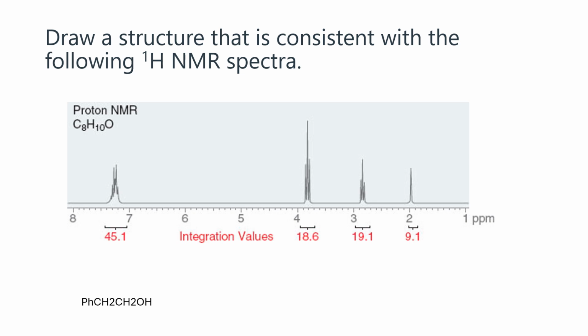Okay, now moving on, let's do these spectra. So C8H10O, so let's do the HDI. It is 1/2, and this is 16, right? Plus 2 minus 10. O doesn't count, so 18 minus 10 is 8. So that's 4 degrees of unsaturation.